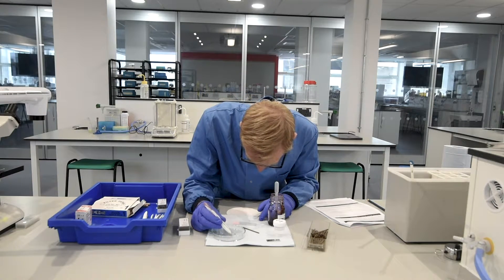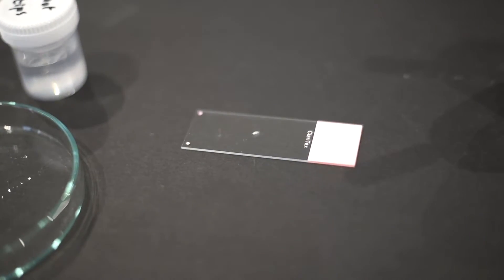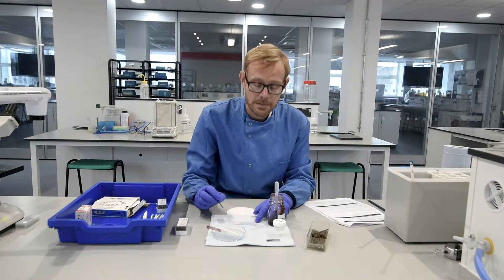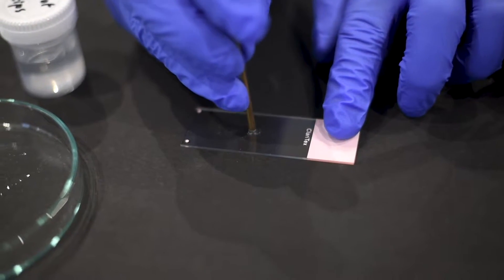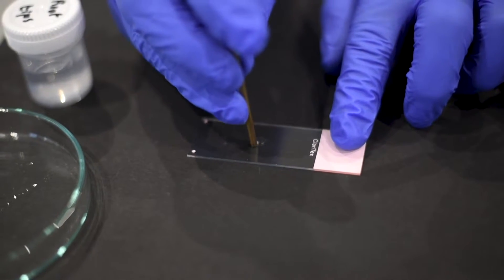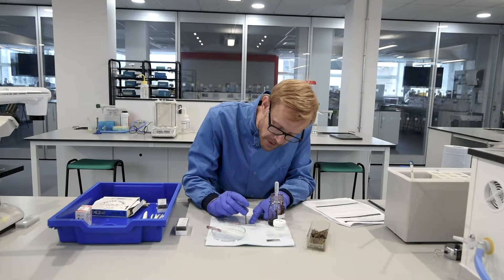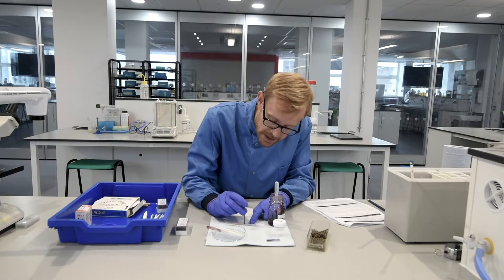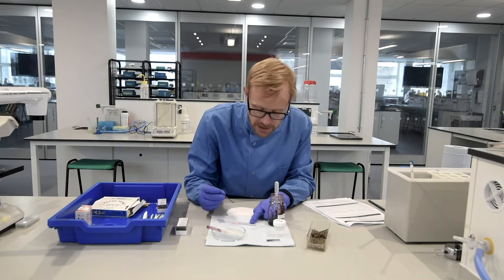We're now going to transfer that root tip onto the glass slide and we're going to rupture the cells within it using this brass rod. We gently apply pressure to the apical end of the root tip, disrupting all the cells, and hopefully what we're looking to create is a single cell layer where we can easily see all the stages of mitosis in the cells.